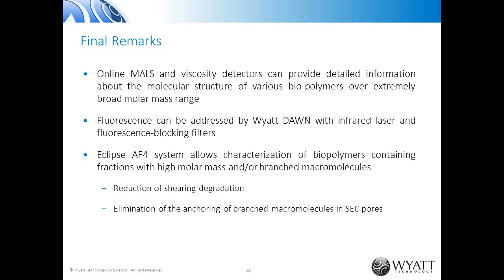An alternative way, which is more laborious but also well feasible, is that we prepare the sample at several concentrations covering about one order of magnitude. The solutions are injected by hand directly into the RI detector. And again, Astra software has a method to measure dn/dc this way. These two procedures are very well comparable.